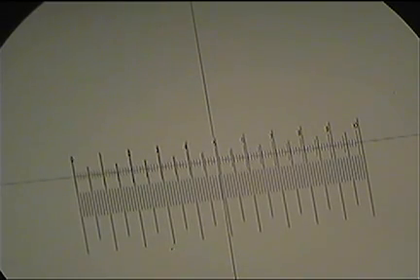That means each unit on the eyepiece graticule, from the 0 to the 1 on that top scale, is equivalent to 0.099 millimeters. So just under 0.1 millimeters. Now we can actually use the eyepiece graticule to measure cells, but we have to remember this is only at this magnification.